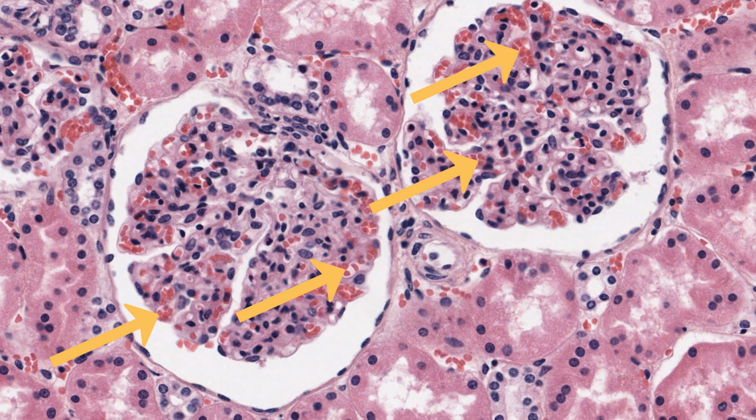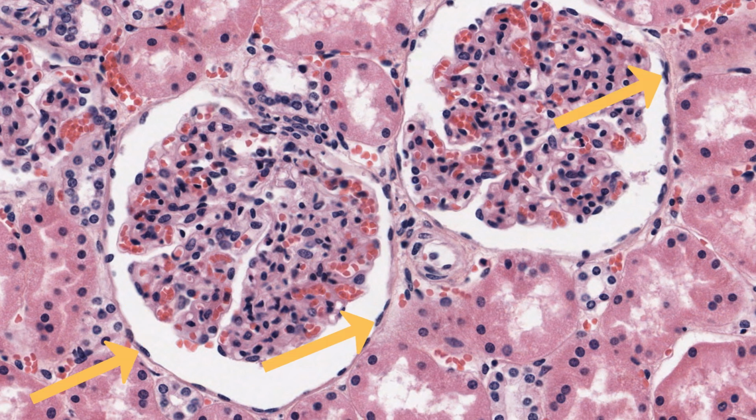Look at this outer wall, which lines the empty space surrounding the tuft of capillaries in the renal corpuscle. It's formed of extremely flattened epithelial cells, an excellent example of simple squamous epithelium. Both the cells and their nuclei have approximately the shape of pancakes, and their appearance depends to a large extent upon the angle at which you view them.